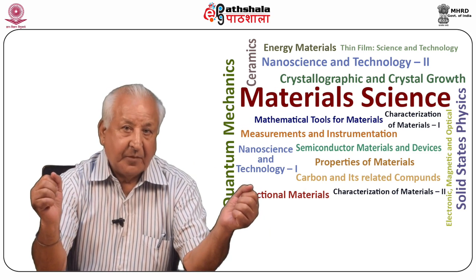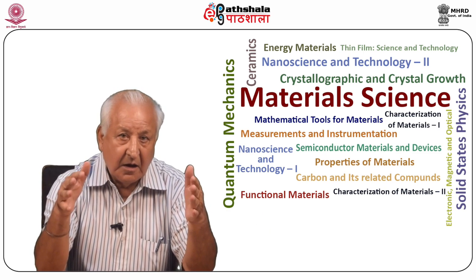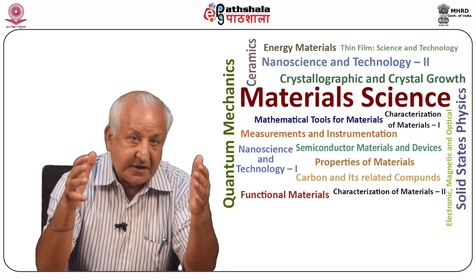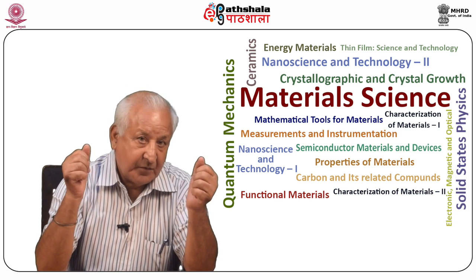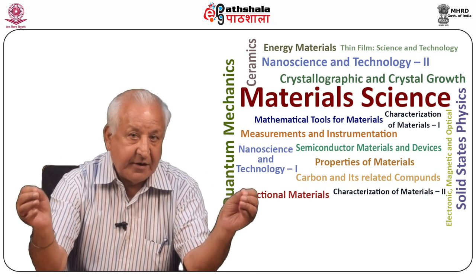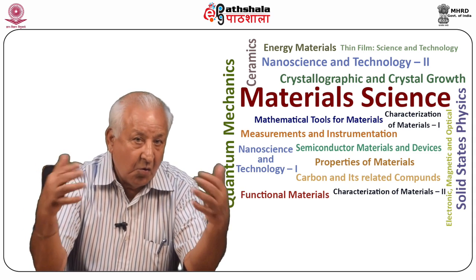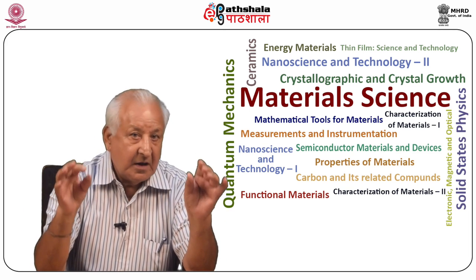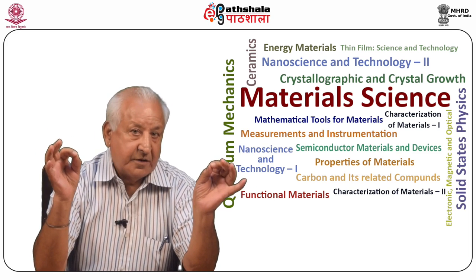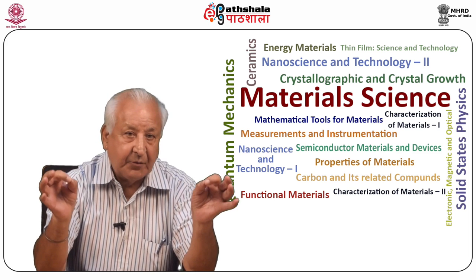To receive the X-rays diffracted by the lattice planes of the crystal specimen at an angle 2θ_B with respect to the direct beam, the X-ray detector is set as shown in the figure. The area irradiated by the X-rays sends out a diffracted beam which gets recorded as a thin line. In order to record the diffracted X-rays from the whole volume of the crystal specimen, the crystal specimen is traversed across the X-ray beam. In order to ensure that the diffracted X-rays are properly recorded, the photographic film is rigidly coupled to the crystal specimen.